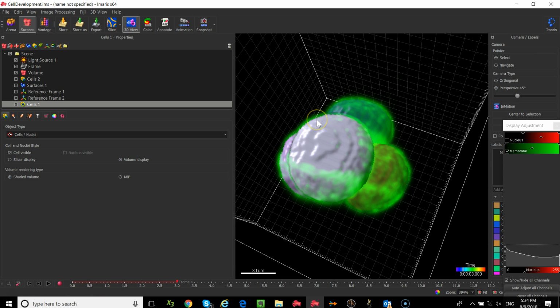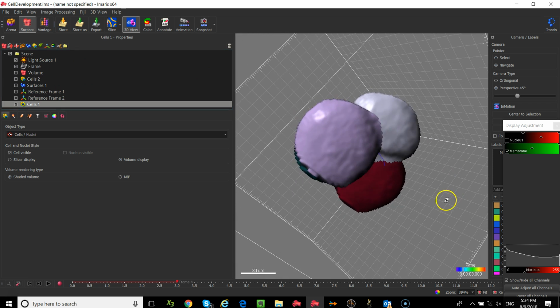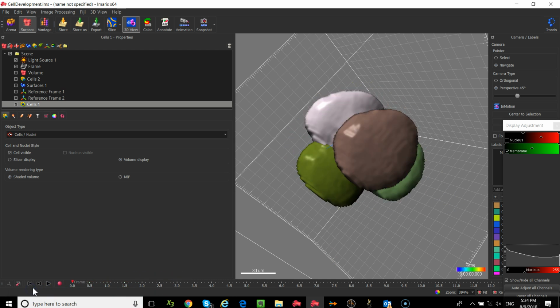So what I want to show you is if you finish your creation, you're going to have a 3D reconstruction of that membrane detection. So let's turn off the volume, and you're going to see your embryo. Yay! And so the color coding is just to represent a different structure. So they're not statistically coded. It's just an object ID. It's just to let you know that's a different object than the neighboring object. Okay, so we just color code them so you see that they're separate, divided structures.